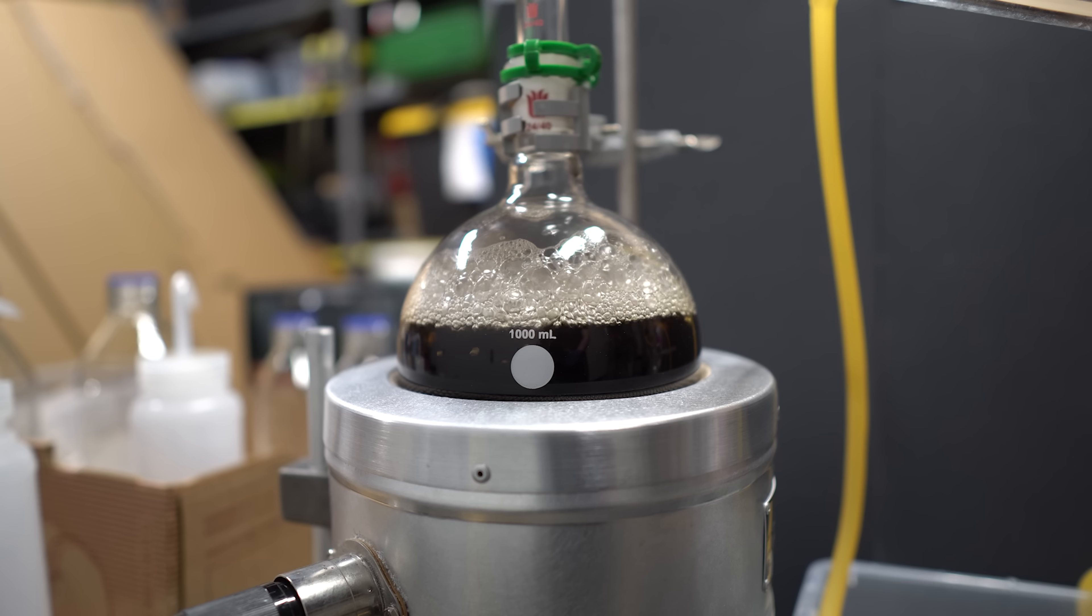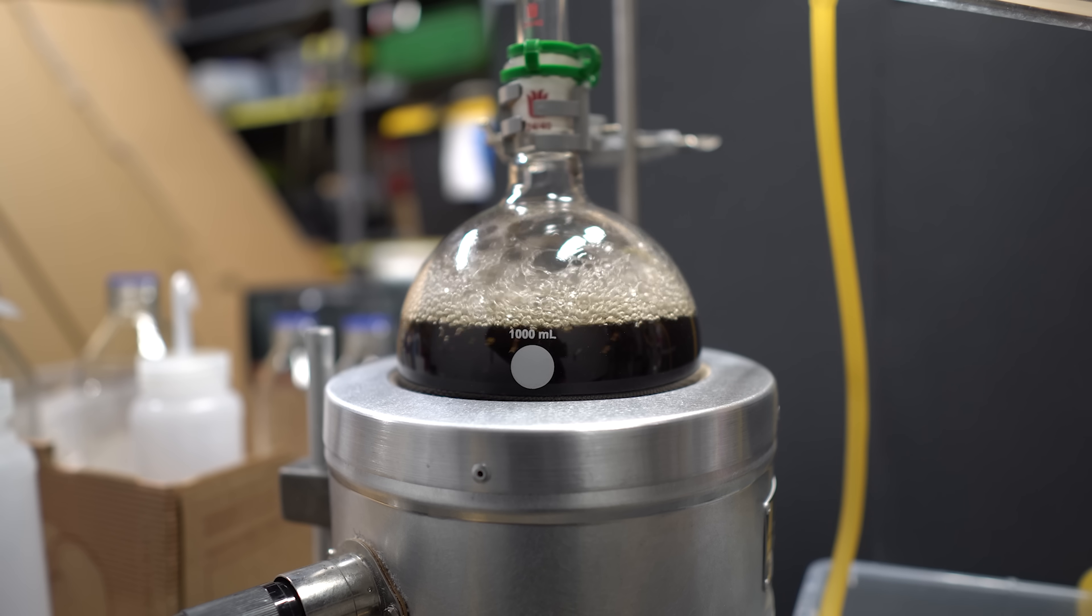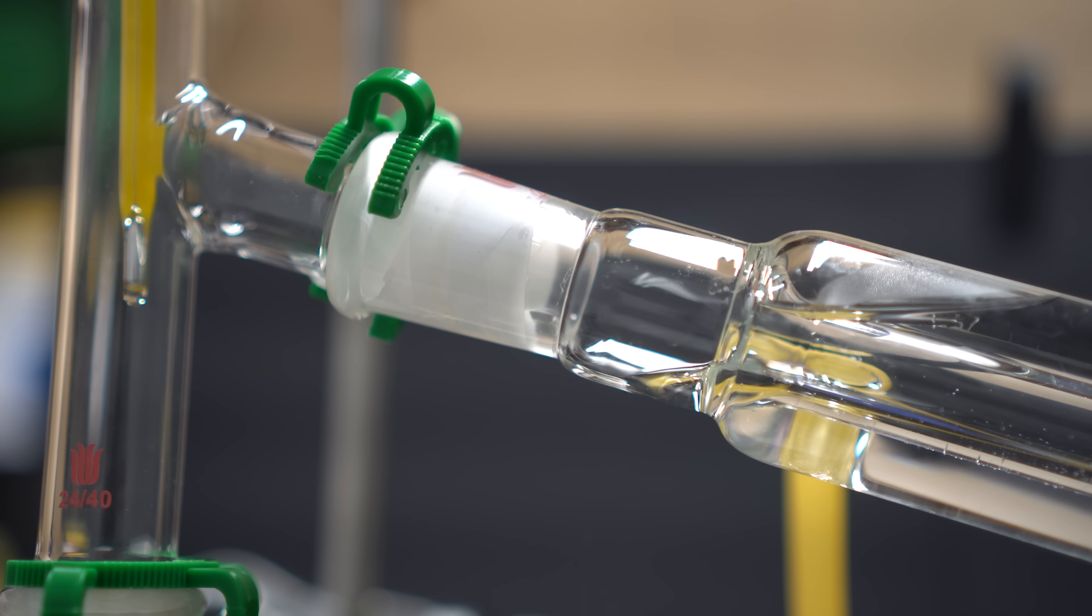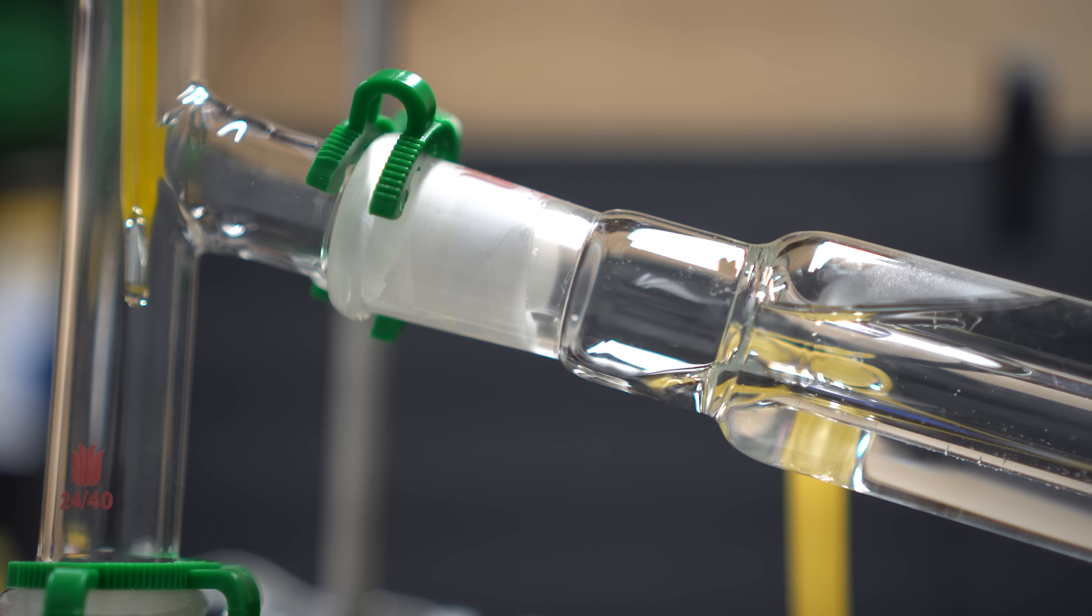As things started to heat up more, it actually started to froth more. This kind of did make me a little nervous, but the frothing really didn't go into the tube, and we're just fine. Essentially, what we're going to do is collect all of the distillate, all the way up to 124 degrees Celsius.